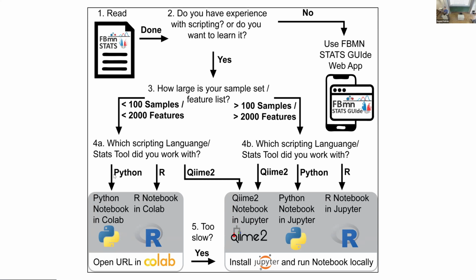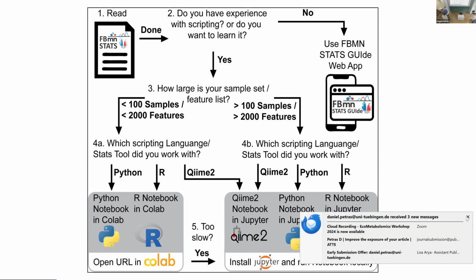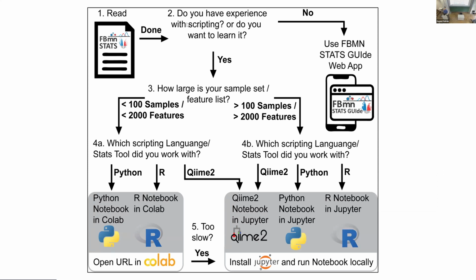To make things easy, if you don't want to deal with scripting and say, oh, Python or R or notebooks, I don't want to deal with it, that's why we have this web app. And also the reason we used it here is because I think this is the easiest way to do the analysis. So that's why we highlighted the web app here. But then if you want to do this more professionally, I would suggest to use either the Colab notebooks or the Jupyter notebooks.